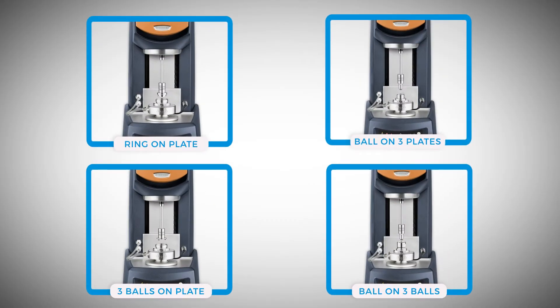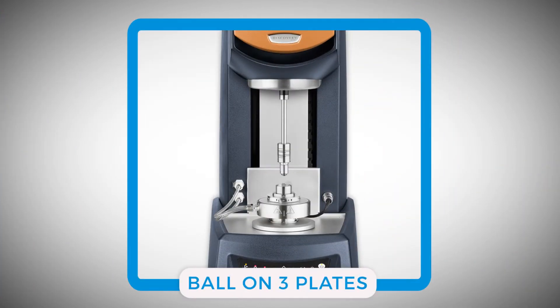TA Instruments' Discovery Hybrid Rheometer is equipped with four different types of tribo-rheometry accessories. Among them, this ball-on-three-plates geometry provides a capability of testing the coefficient of friction on a solid surface with some low viscosity media in between.